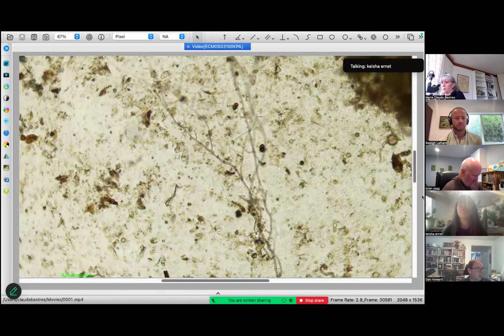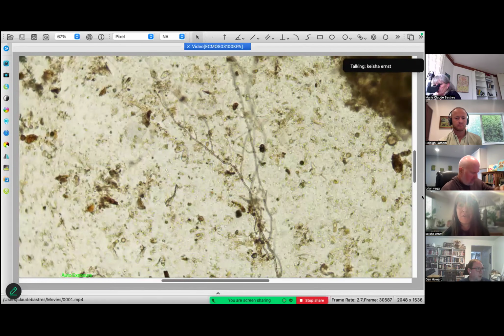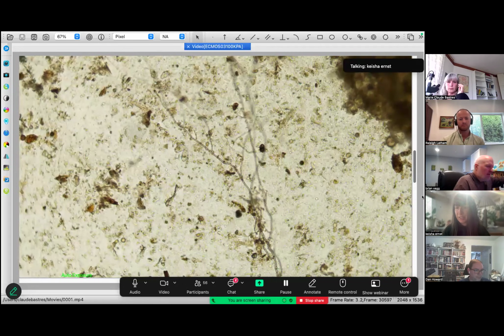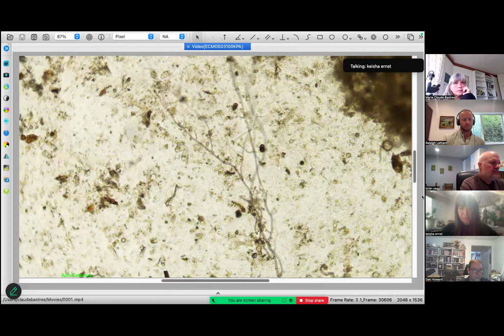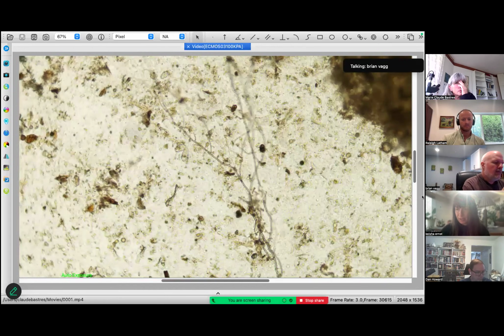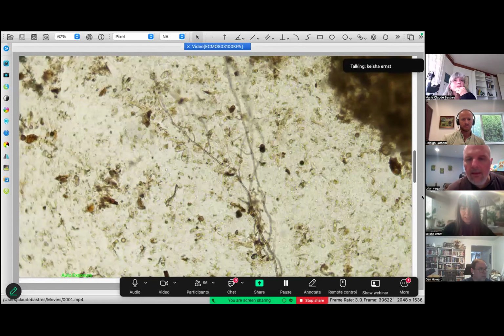If you want to look for protozoa, my favorite is Arcella. I'll actually type it in here. .nl, right? Arcella.nl. Oh, no, I put in Marcella.